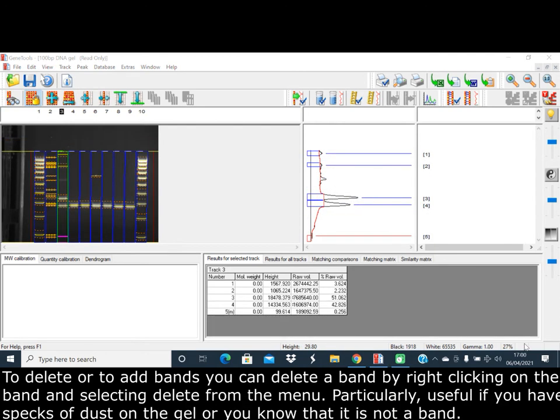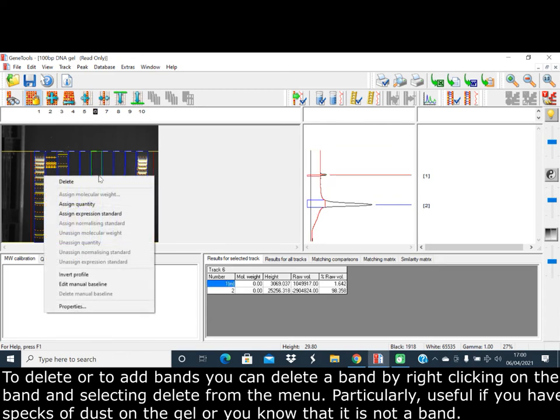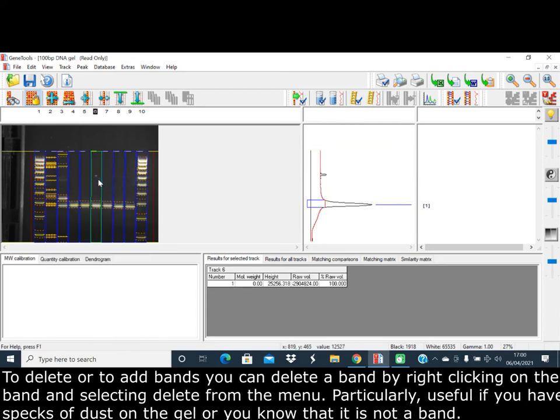To delete or add bands, you can delete a band by right-clicking on the band and selecting Delete from the menu. This is particularly useful if you have specks of dust on the gel or you know that is not a band.